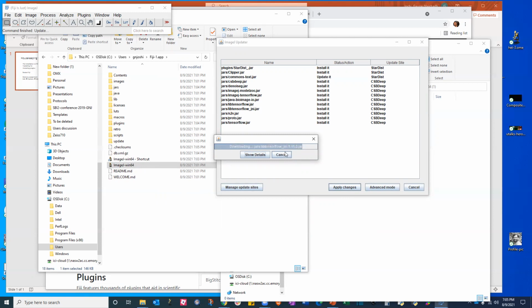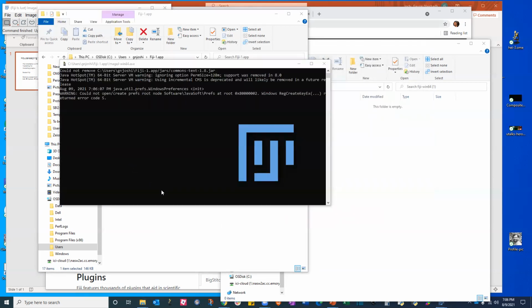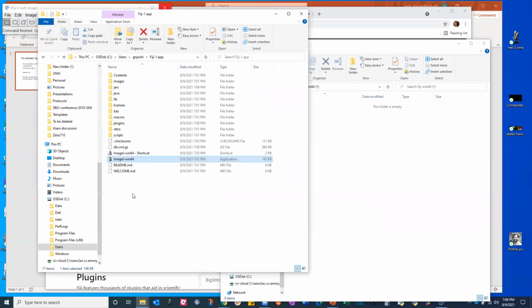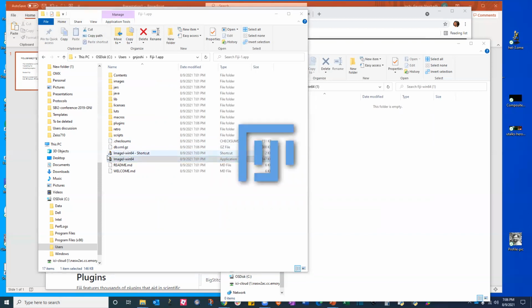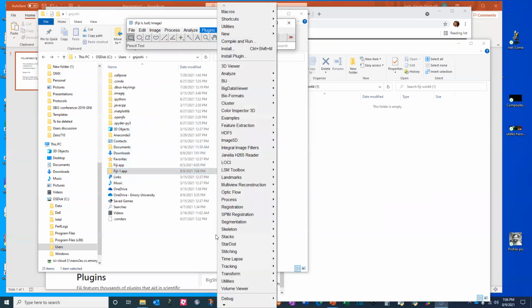So, but to have StarDist functioning, you also need to download CSBDeep. All right. So once that's done, once I restarted my Fiji, which I don't think it restarted. So let me restart Fiji. So I restarted this. And now if I go to plugins, I can see StarDist right over here as my plugin, which was not present earlier. And I should have showed that to you that it was not present earlier, but just take my word for it, it was not.